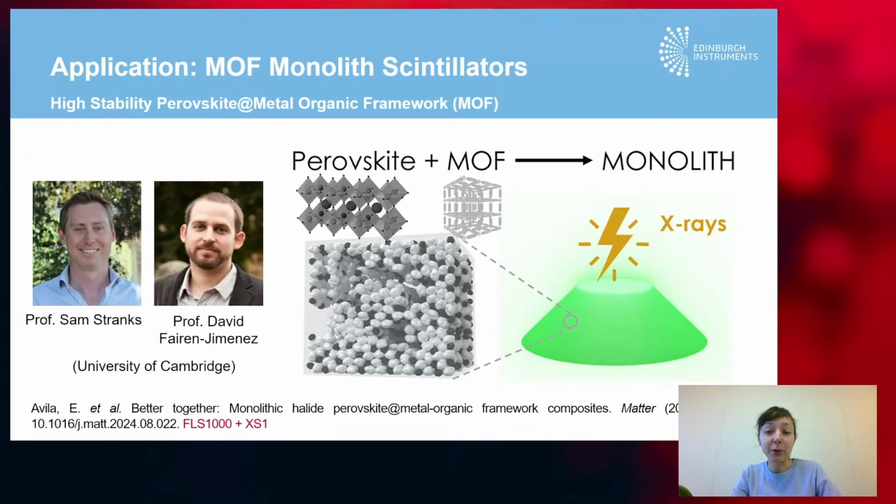The next example is a more complete publication on the XS1. It's from the same group in collaboration with David Fairen Jimenez, who embedded perovskites into a metal organic framework matrix. Metal organic framework is abbreviated as MOF. The goal of this was to improve stability to moisture, to oxygen, and to radiation.